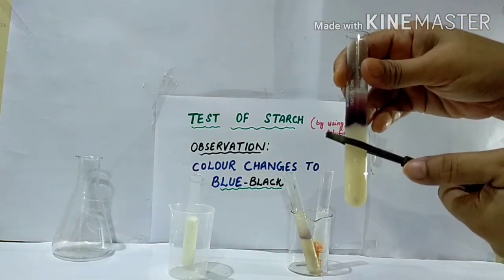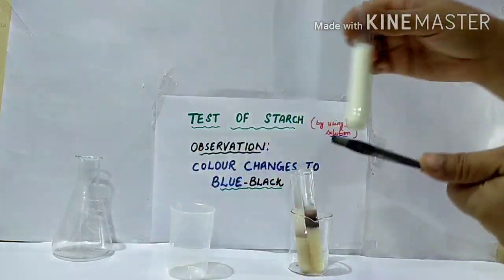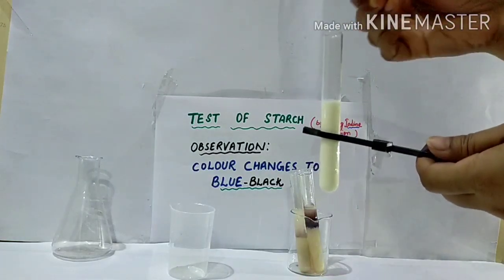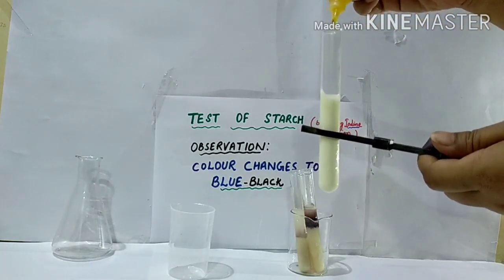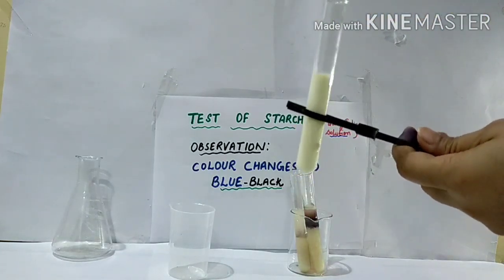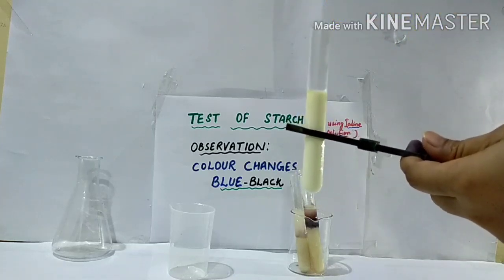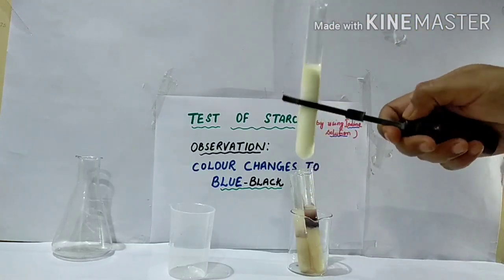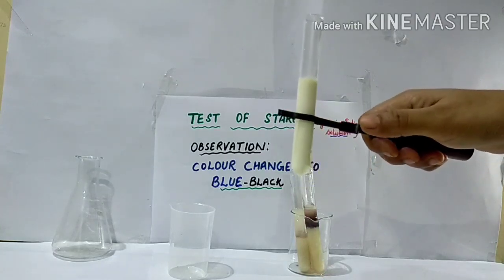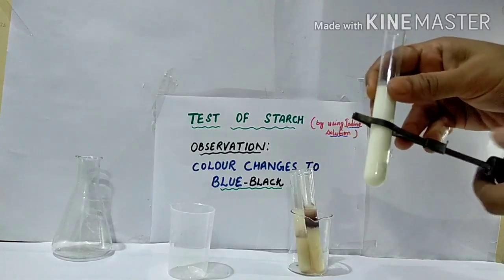The next food item I am taking is milk. I have taken milk. You can see the color of milk does not change. This means that milk does not contain starch — it contains sugar and protein.